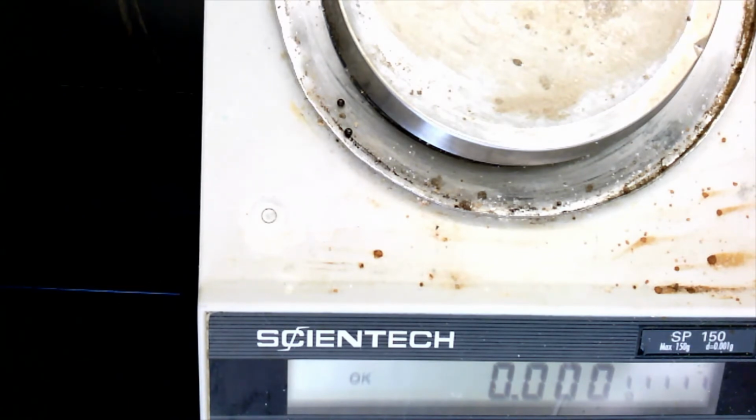So the difference between our starting mass of magnesium and our ending mass of magnesium oxide should just be the total mass of magnesium, or sorry, let me say that again. The difference between the mass of our magnesium oxide product and our magnesium that we started with, the reason why it's gained mass is just due to oxygens. So the mass of oxygen is going to be the difference in mass between our magnesium oxide product and our magnesium starting material.